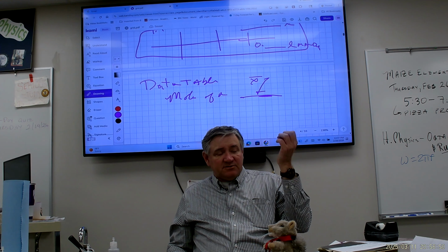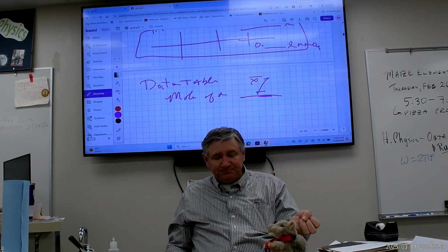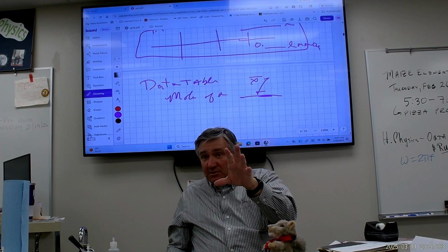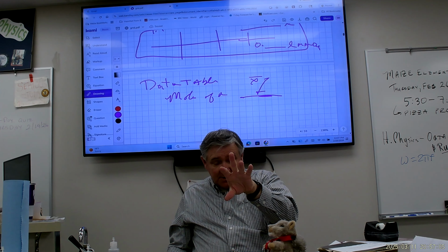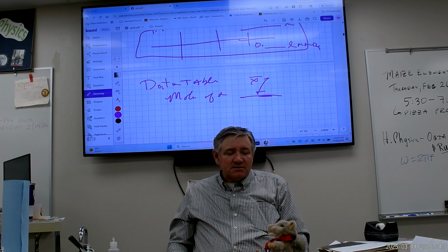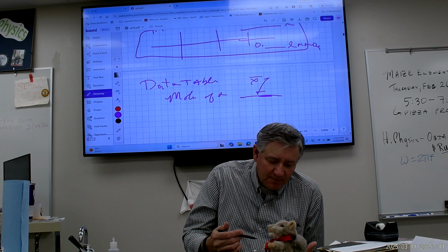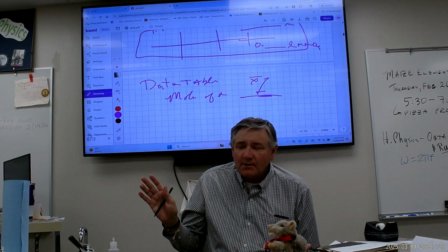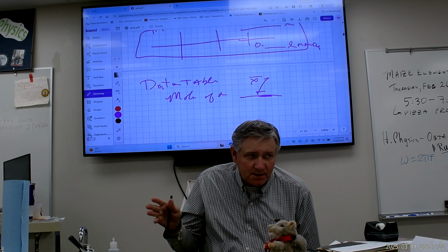So the whole purpose of the first 3 titrations was to find the molarity of the MnO4, knowing the molarity of the Fe2+. The next part, you're going to know the molarity of the MnO4, because that's what you just found, and then you're going to use that to find the molarity of your oxalic acid. So again, on this one, you're only going to do 2 trials. I don't need to see the whole kit and caboodle. I just need to see one complete calculation of that titration.